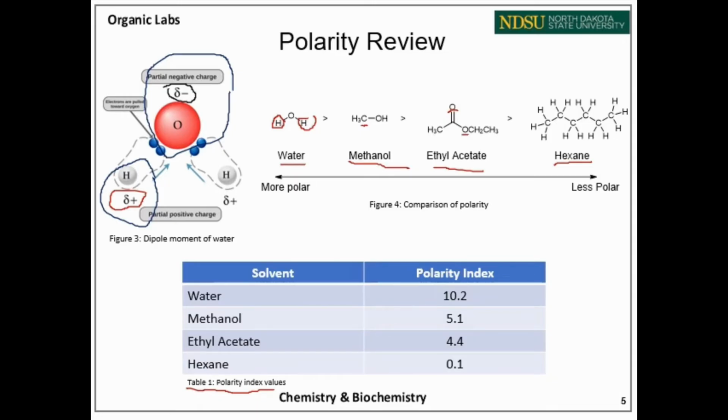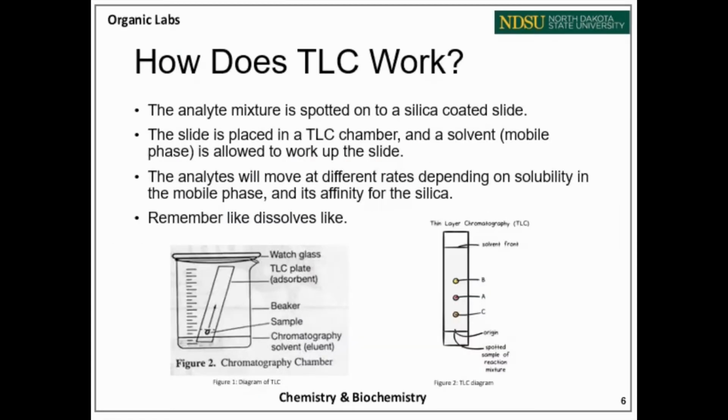But it is nice to be able to reason your way through what is a polar molecule versus what is a nonpolar molecule. Next, let's get back to TLC and how it actually works.